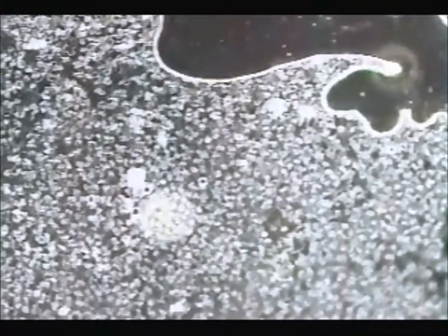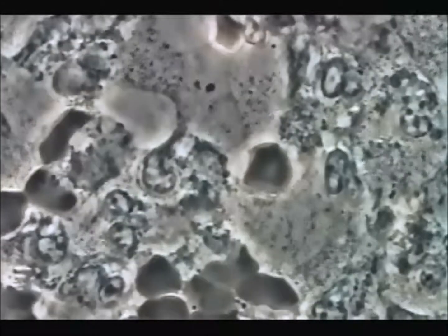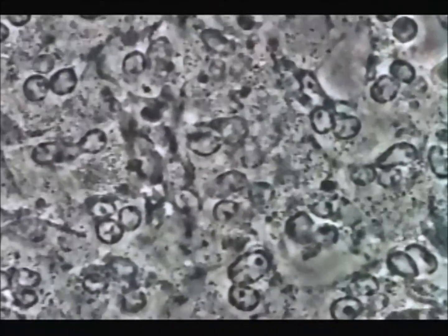Here we are in the case of a chronic periodontal disease. We have a microscopic view of the biofilm at 100 times magnification, and you see the little white cells everywhere. Now we pass to 1000x magnification.